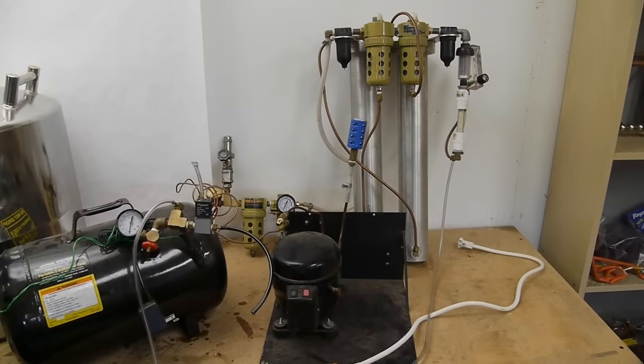However, there's quite an expansion ratio. To make one liter of liquid nitrogen it takes approximately 700 liters of dry nitrogen gas at atmospheric conditions.